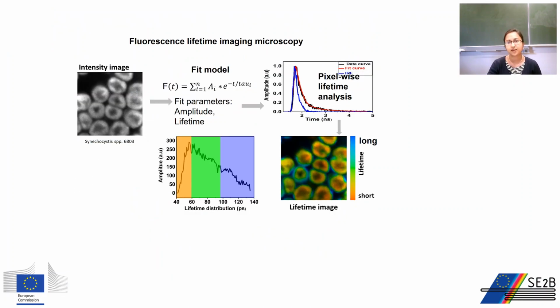Individual cells are studied with fluorescence lifetime imaging microscopy in order to investigate if there are structural changes in the thylakoid membrane accompanying the state transitions. Lifetime imaging also provides information about the distribution of photosystem complexes in the thylakoid membranes.